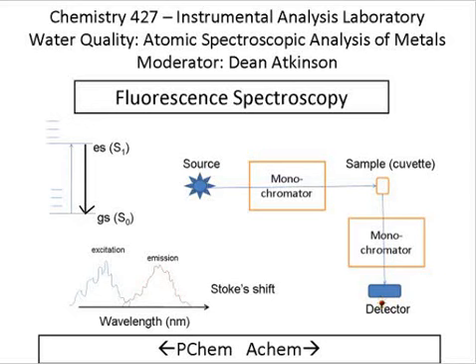So because this is a molecule rather than an atom, there's not just one distinct electronic ground state and one distinct electronic excited state, excuse me. In fact, there are a whole bunch of vibrational states associated with the ground electronic state, and likewise there are a whole bunch of vibrational and rotational states associated with the excited electronic state. So when we go from the ground state to the excited state, there's multiple possibilities. So one of them is the first arrow that I sketched, but there are also arrows that go from the ground state to a higher level of the excited state.